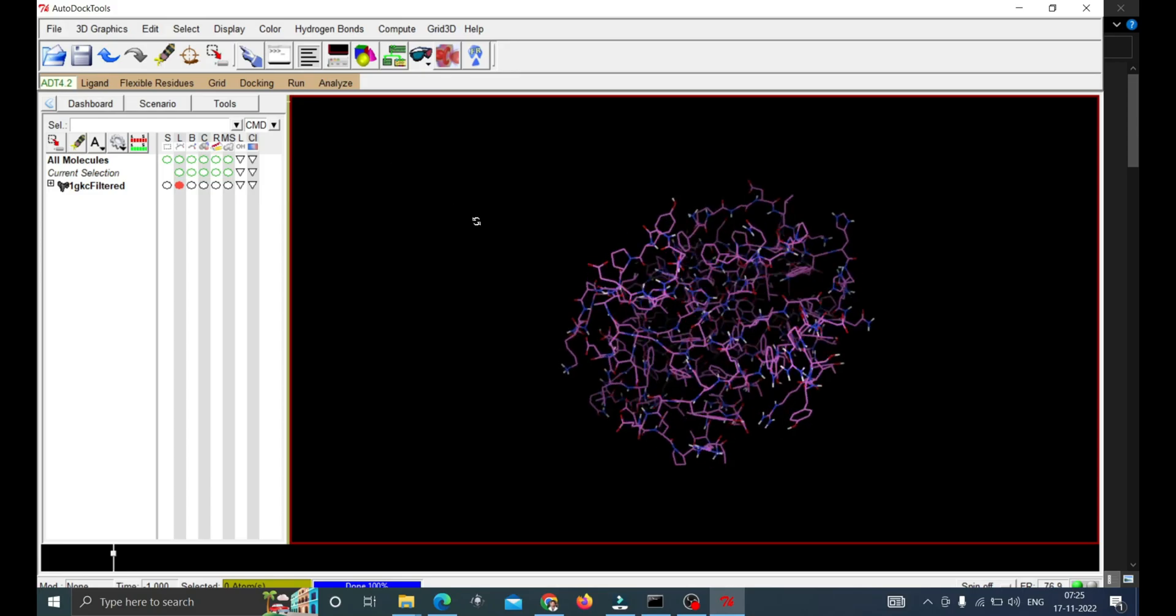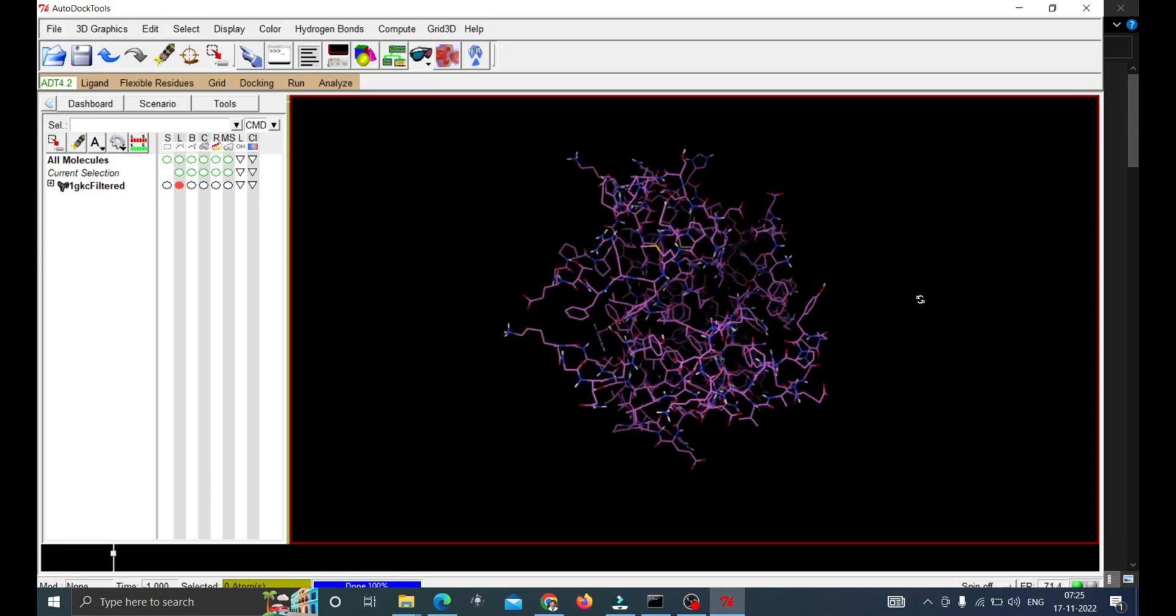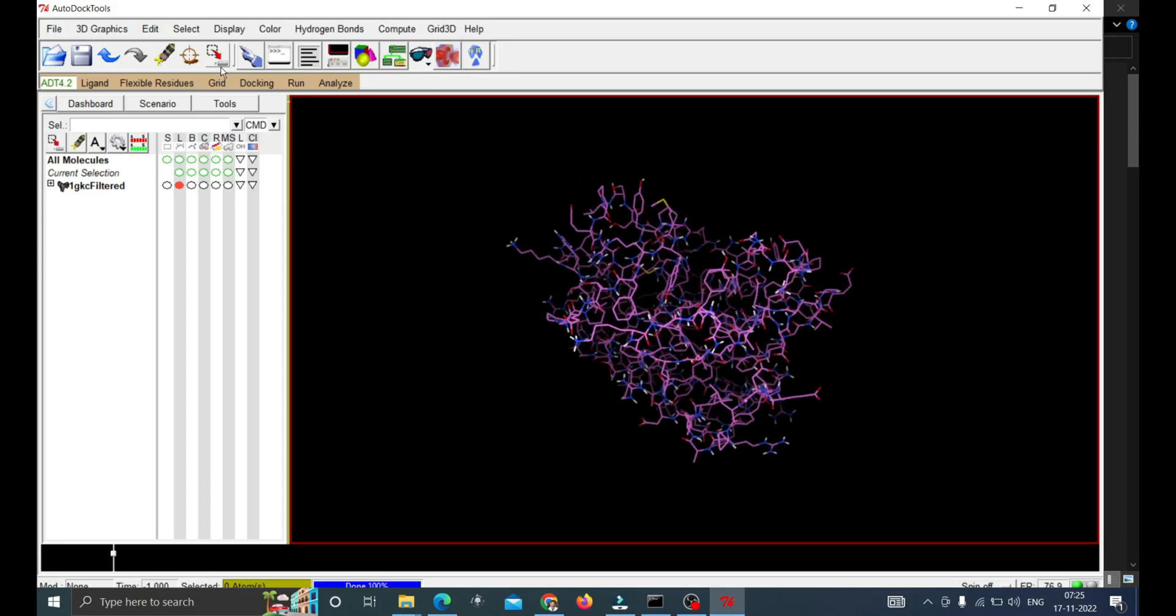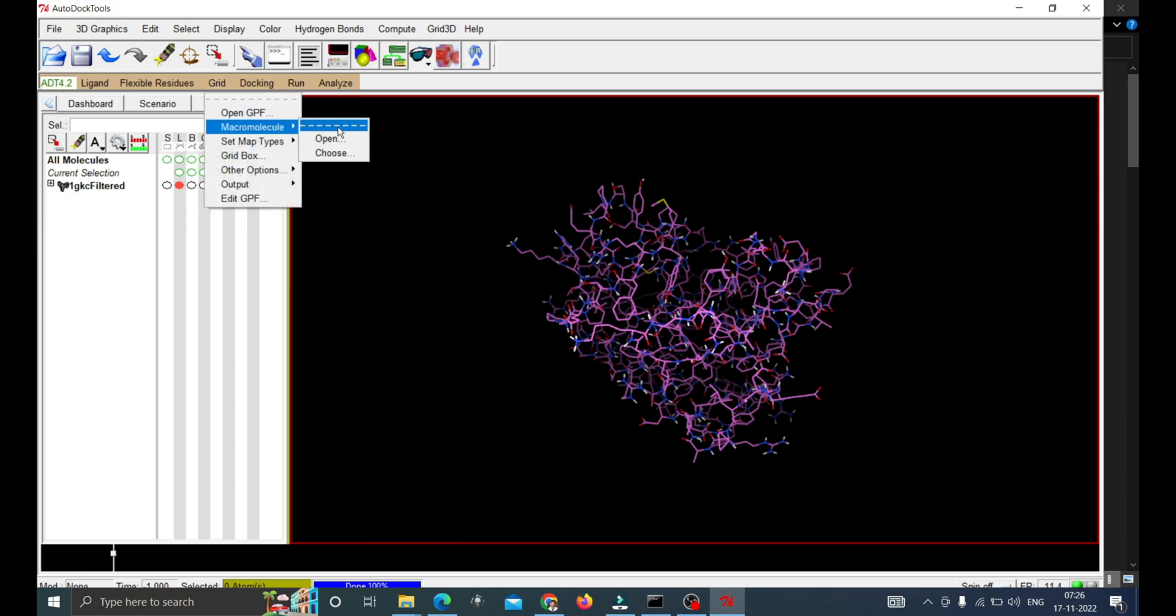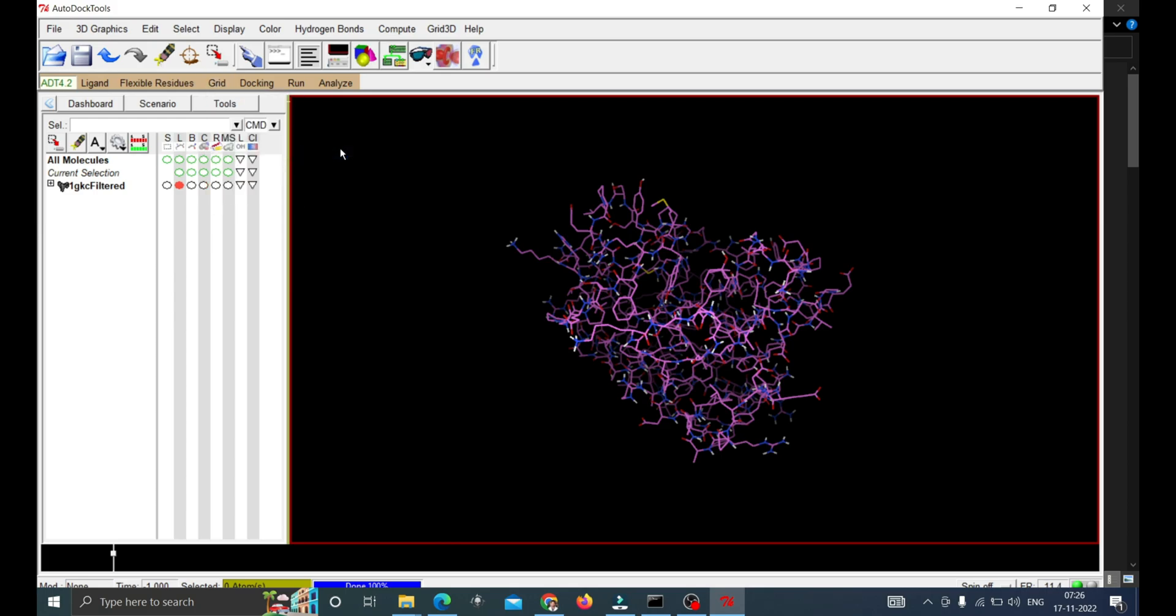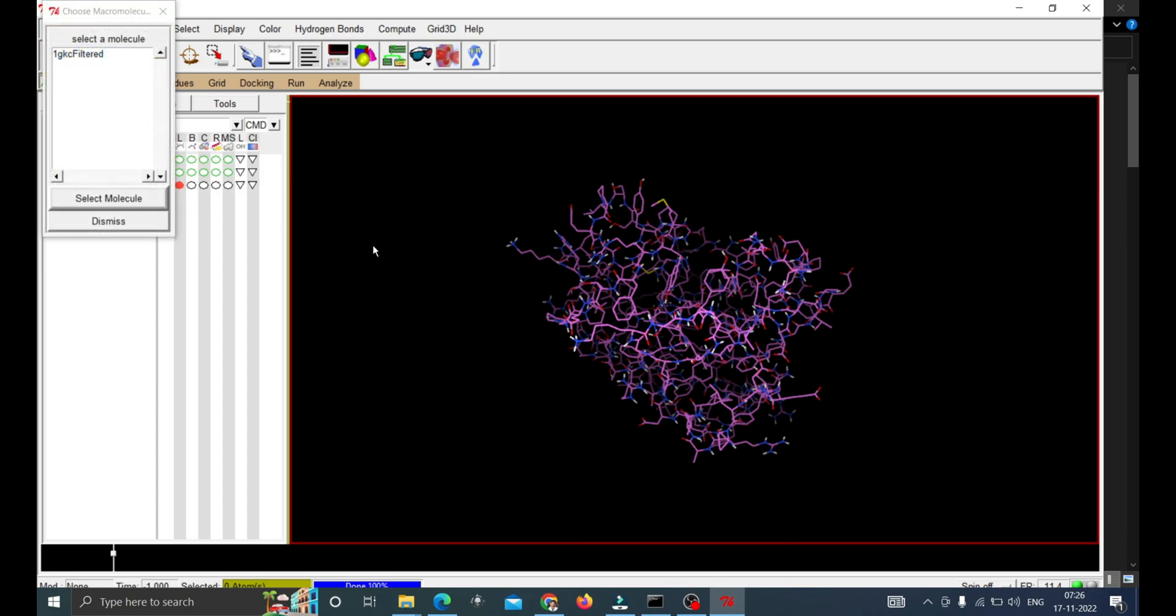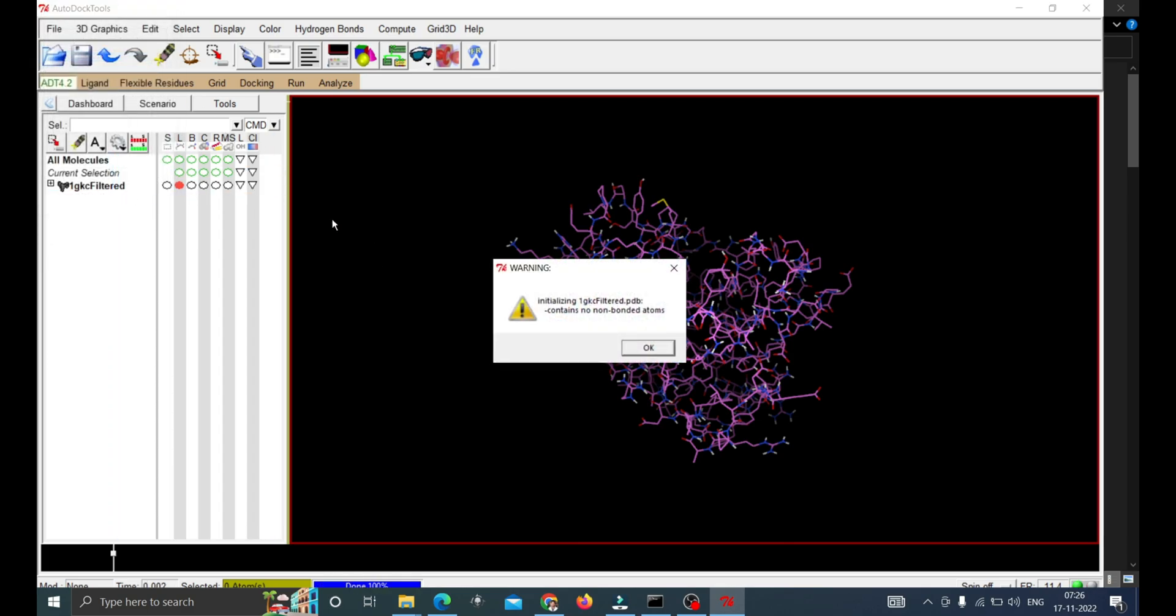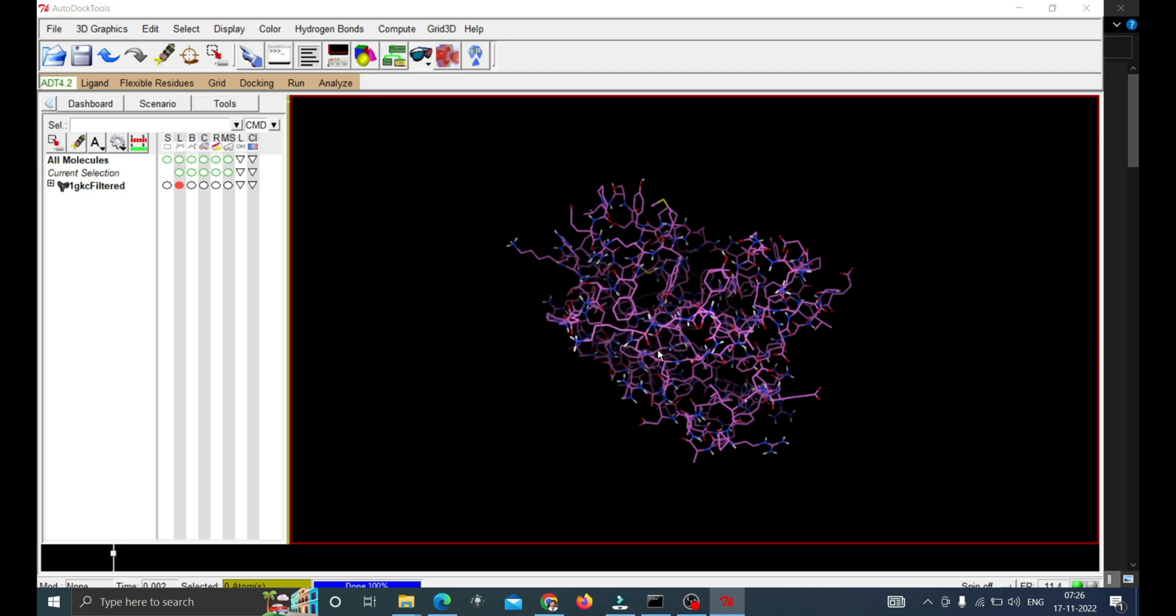Next thing is we have to save it in the AutoDock format which is PDBQT. Click on the Grid and then click on Choose under macromolecule. Click on the 1GKC_filtered and then click Select Molecule. While preparing there shouldn't be any non-bonded atom error in the process. This shows there is no non-bonded atoms.